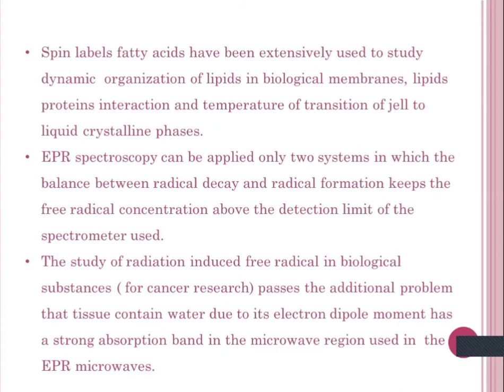An example of this work is the study of radical reactions in single crystals of amino acids exposed to X-rays. This work sometimes leads to activation energies and rate constants for radical reactions.